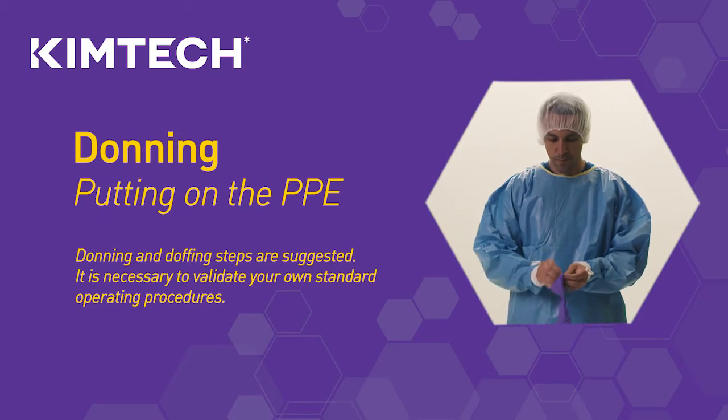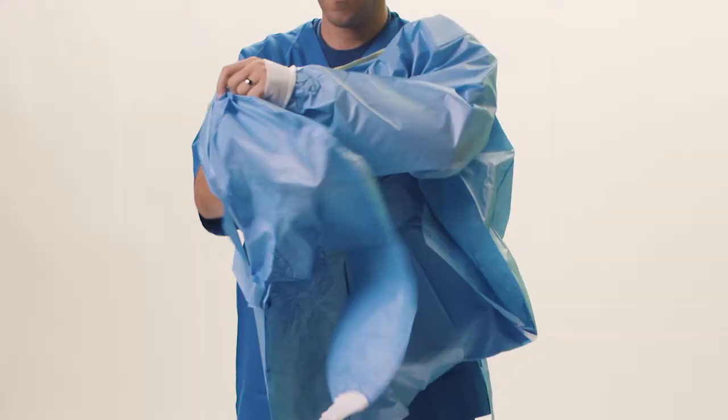Here's how to put on the gown and gloves. Push your arms through each sleeve of the gown. Tie the straps at the neck and at the back of the gown.